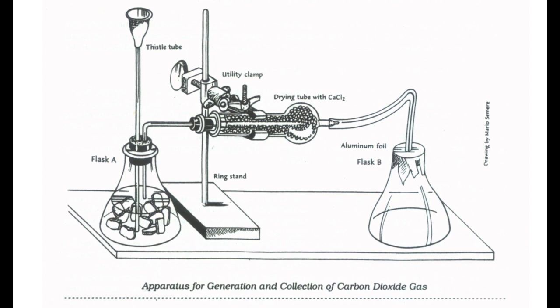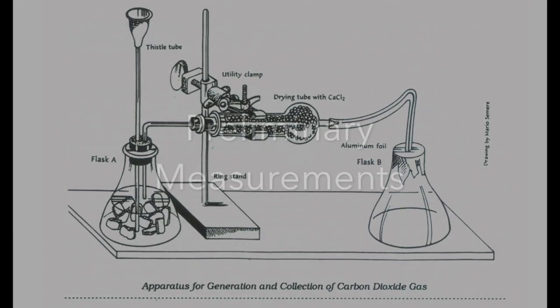You can see we have flask A where we have a thistle tube for adding acid into our calcium carbonate chips. Carbon dioxide will pass through the drying tube and be collected in flask B. Flask B is covered with foil, and we will see a little bit more about that later.